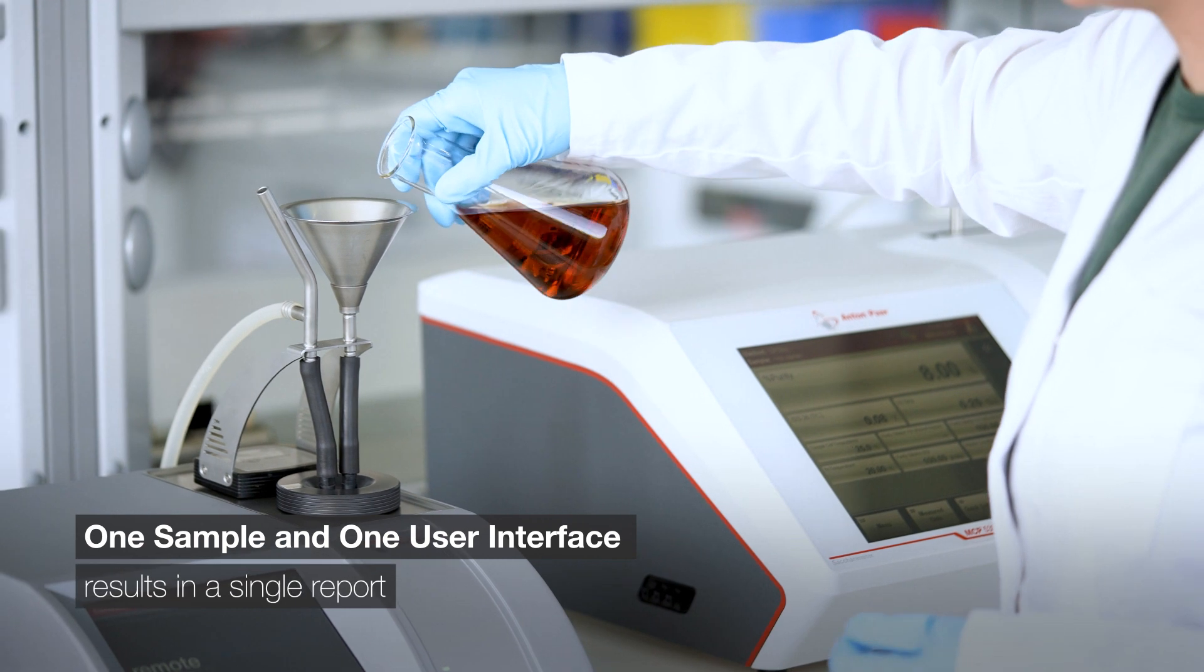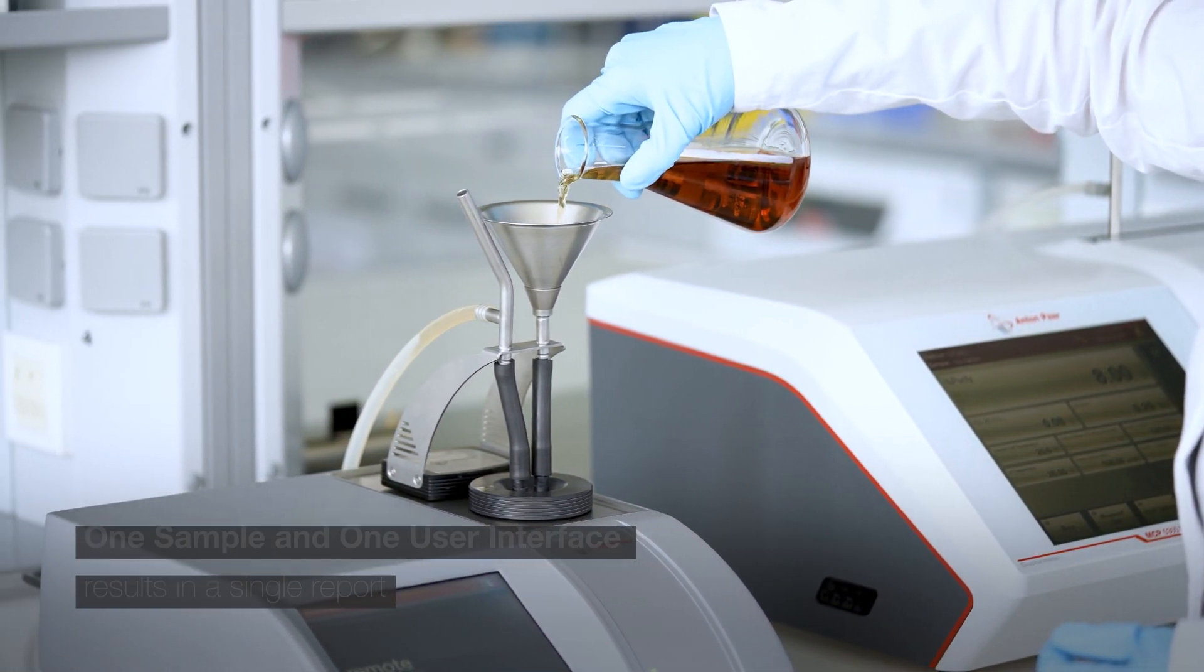Joint analysis of the data from both instruments in a single, final report.